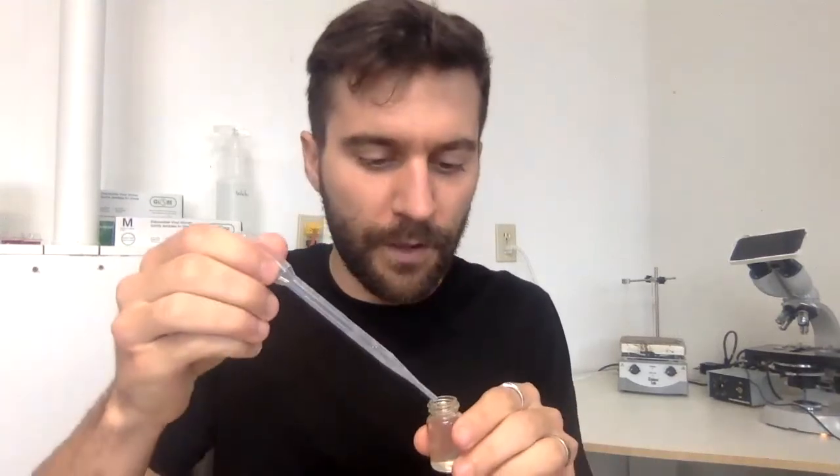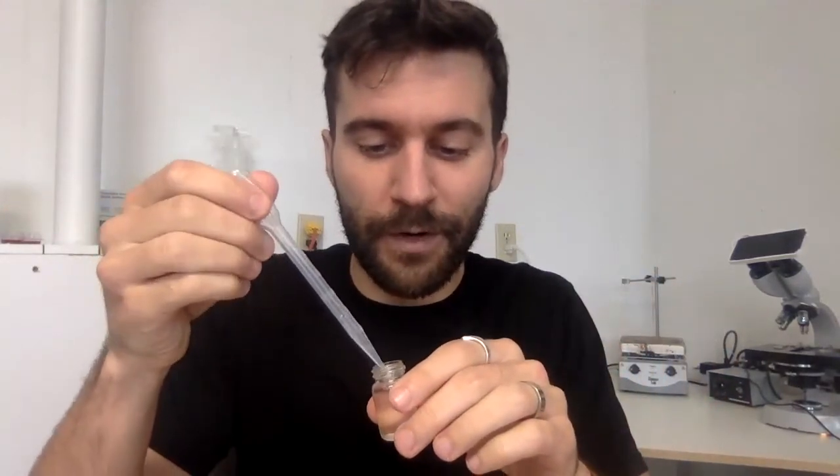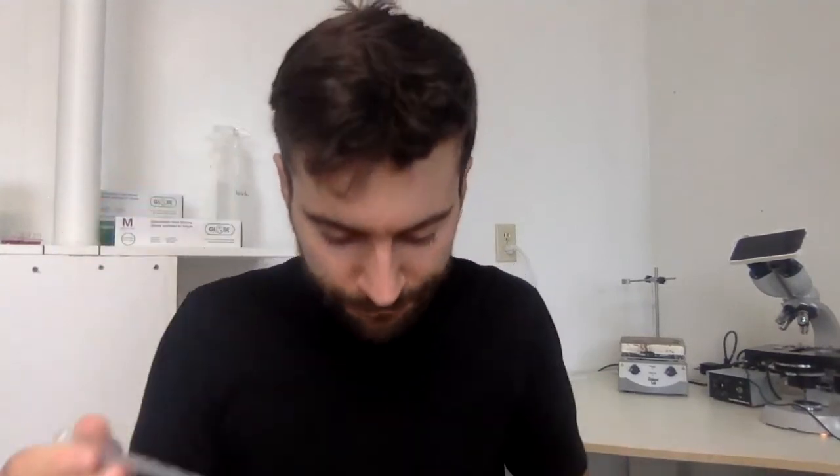Let me just do that real quick. You don't need to see this. It's as boring as it sounds. I'm just taking a very small sample and putting it under a glass plate. When I say small, it's about 0.00001 milliliter, that order of magnitude approximately. So I just need a drop less.